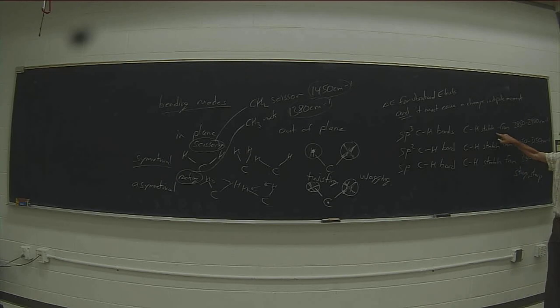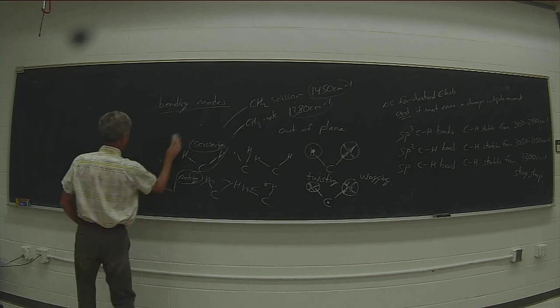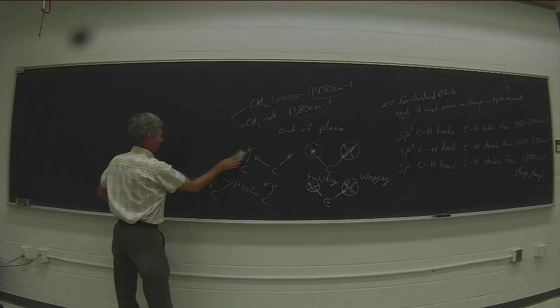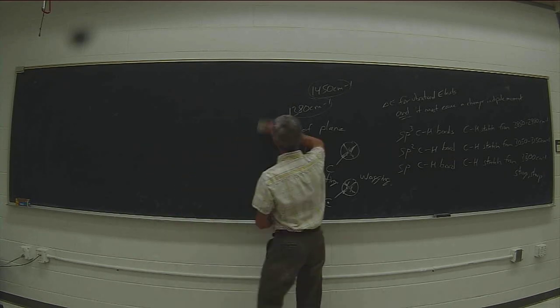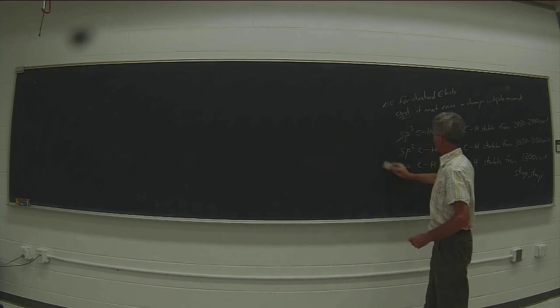and then you're looking for the CH stretch in the region around 2900, but not going over 3000. If you go over 3000, then you know you have either an alkene or an aromatic compound present. If you see a peak at 3300, it might be an alkyne, but it could also be an alcohol. The OH stretch shows up in a very similar region as the sp CH stretch.